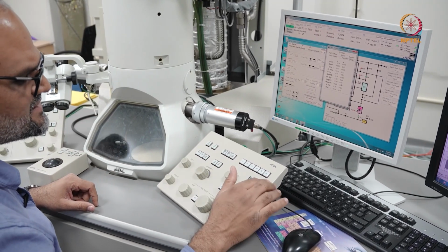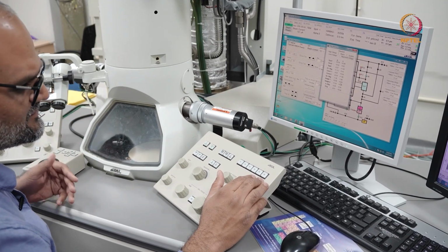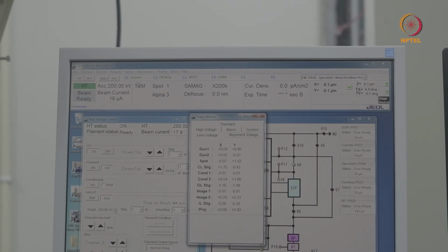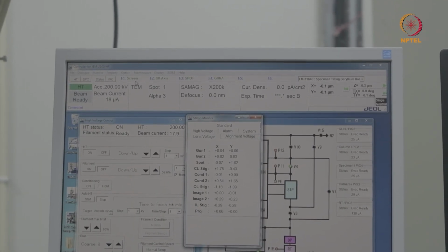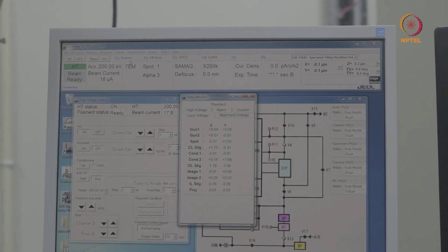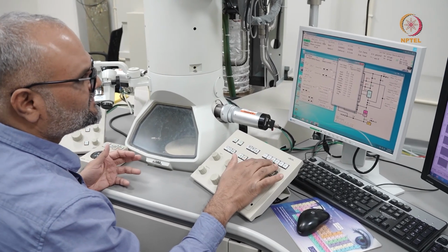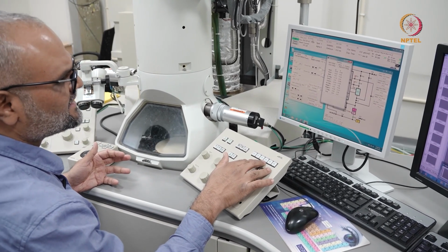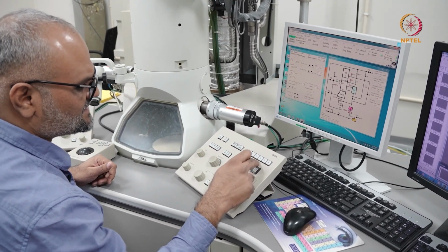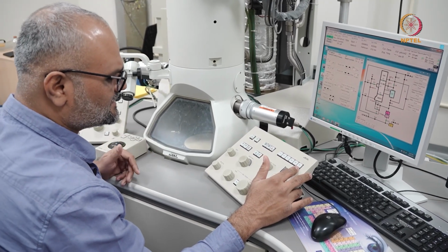You also have these function knobs here. Different instruments and different locations, different labs have different conventions. Over here, the shortcuts to what these function knobs are given here. For example, when I press F1, it is the screen lift button. The F2 is if you're using an off-axis camera, F3 is to change the spot size, and F4 is for gun alignment in this particular system. Nonetheless, depending on which facility you're using, these function knobs might have different assignments.